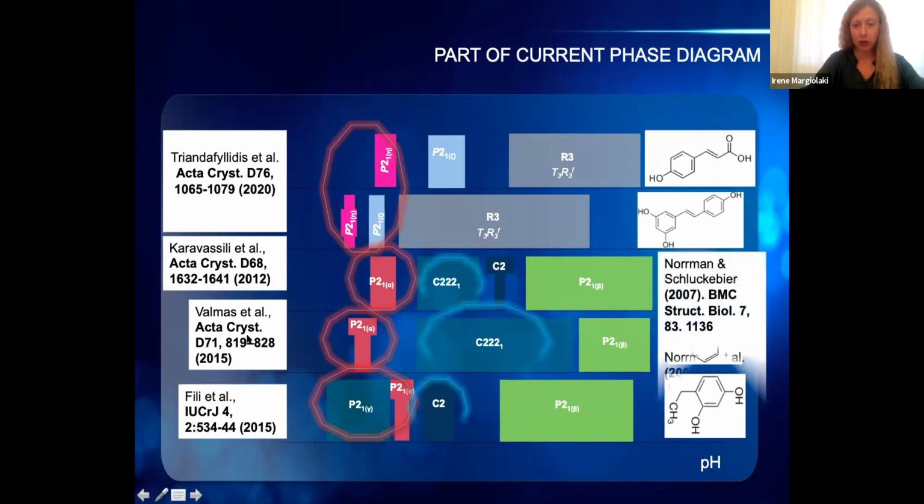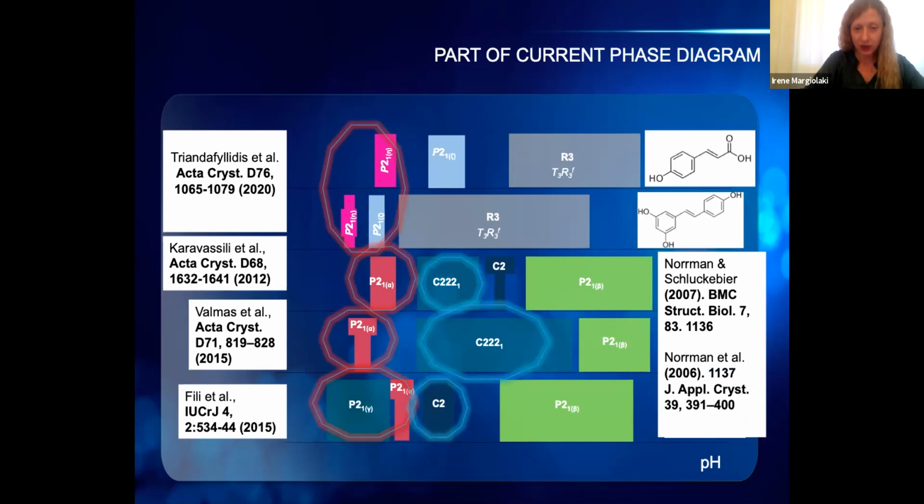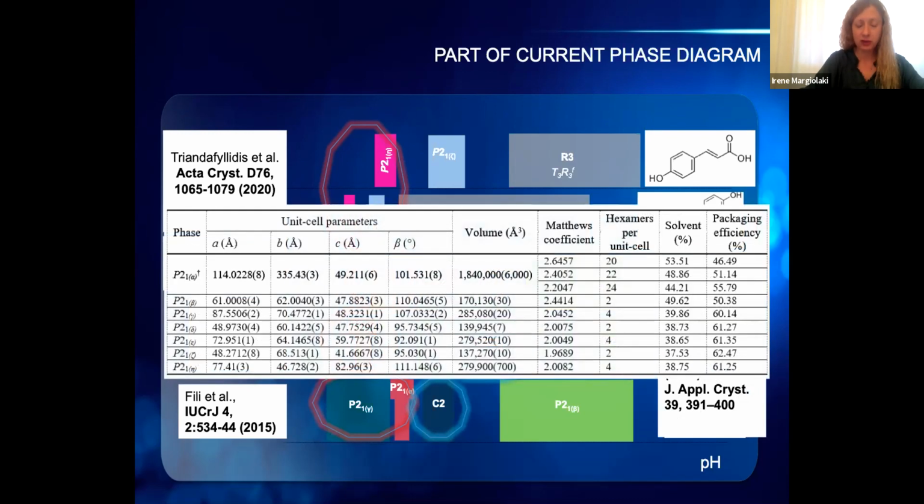And these 2 forms, one is monoclinic, the other is orthorhombic, were identified by our colleagues at Novo Nordisk, first from powder diffraction and then solved from single crystal techniques. So insulin has a very rich phase diagram. These are the 7 polymorphs we discovered. It's all the same space group, but completely different lattice dimensions.